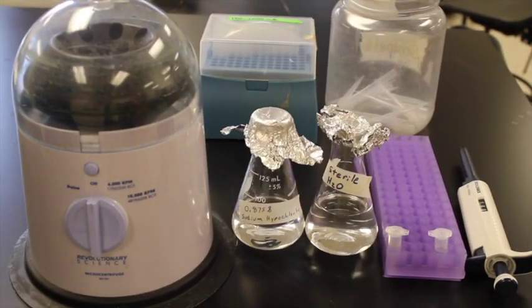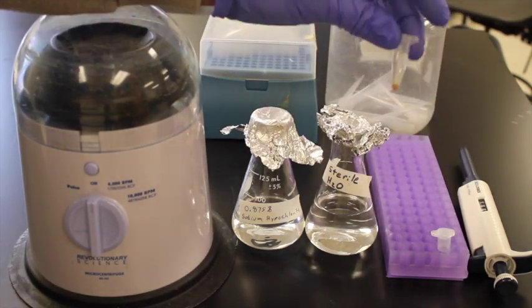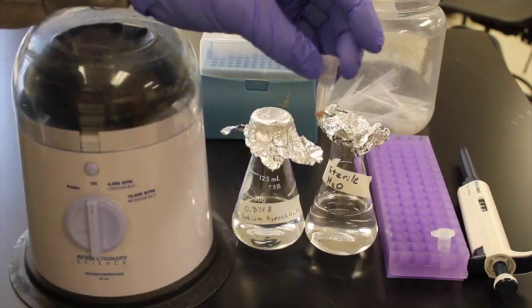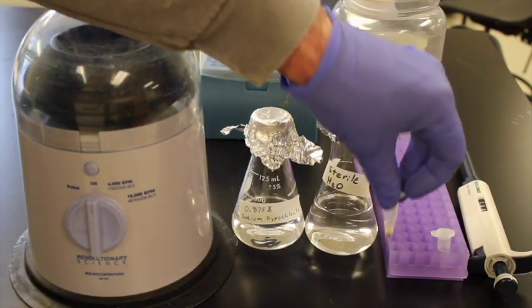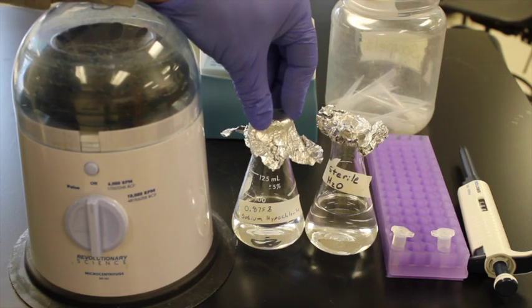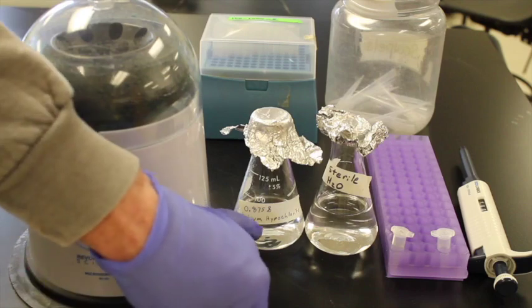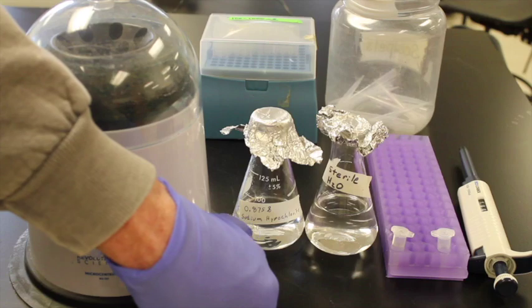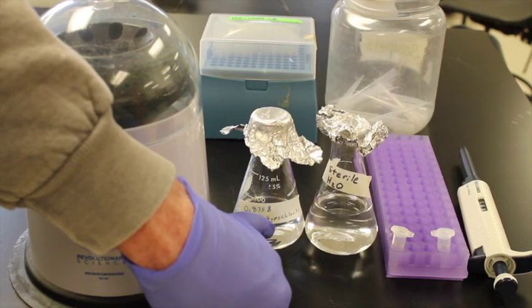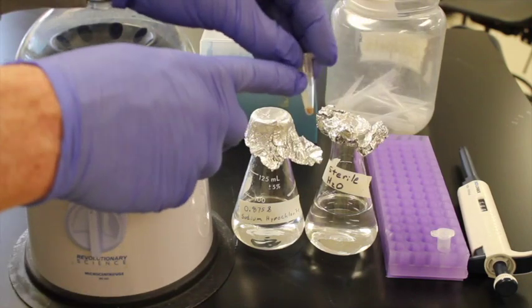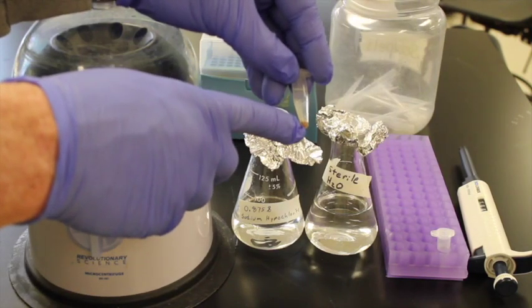The next step is to sterilize the spores. So I've waited 15 minutes. Here are my spores. They've fully imbibed the water so they're all ready to go and ready to be sterilized. What I've made up in the meantime is a solution of 0.875% sodium hypochlorite. Sodium hypochlorite is bleach. So I basically took bleach that you get from the normal store, made up a 0.875% solution.